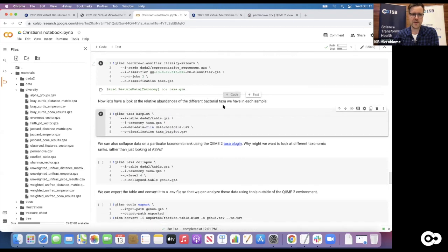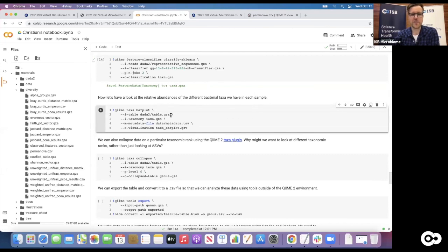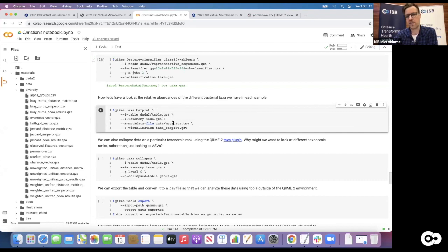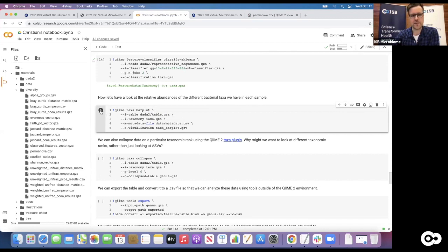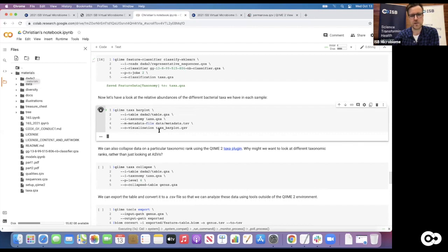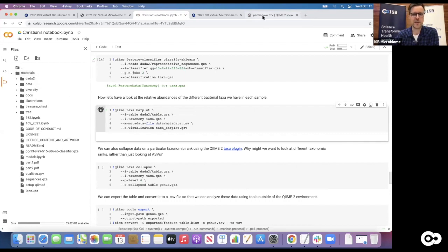Is E. coli very abundant in the ocean, or not? We can do a simple bar plot for that. We use our abundance table from the very beginning that DADA2 generated, our taxonomy assignment, and our metadata so we can order samples by environment. As you see, later commands use more and more of the information generated previously - that's kind of why this is a pipeline. We generate a taxa bar plot visualization, which will be in the materials folder called taxa_bar_plot.qzv. Let's refresh, download it, open it in the visualization portal.